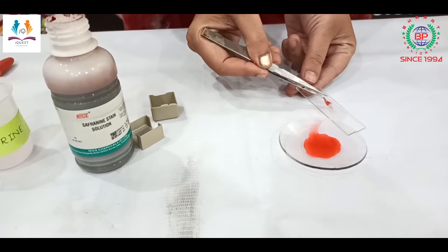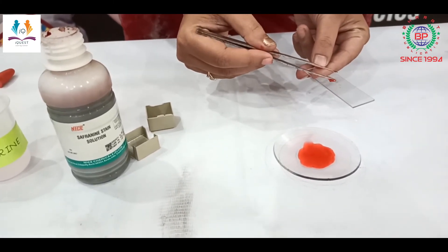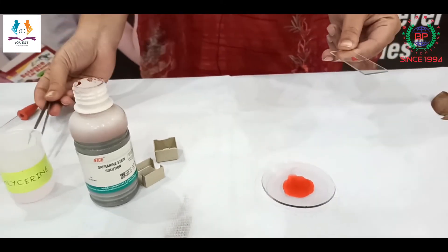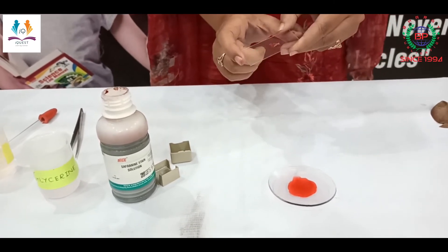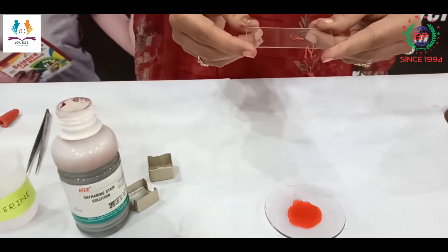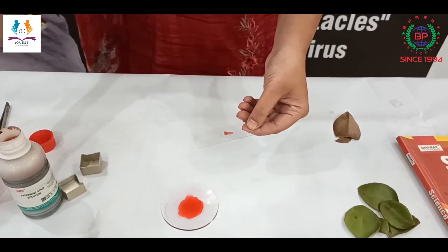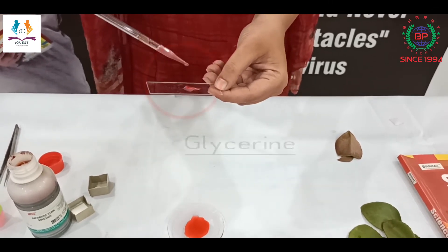After two to three minutes, I am going to transfer this peel onto the slide — on the center of the slide carefully. We should always hold the slide from the edges. Now I have the stained peel, and I am going to add a drop of glycerin over it.